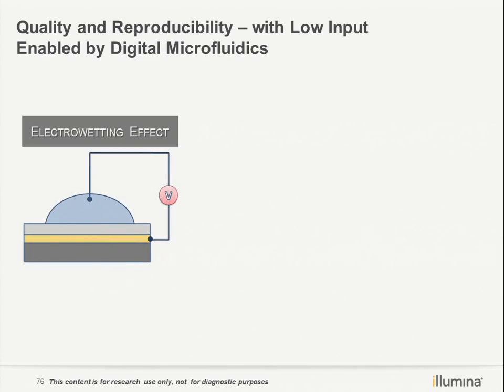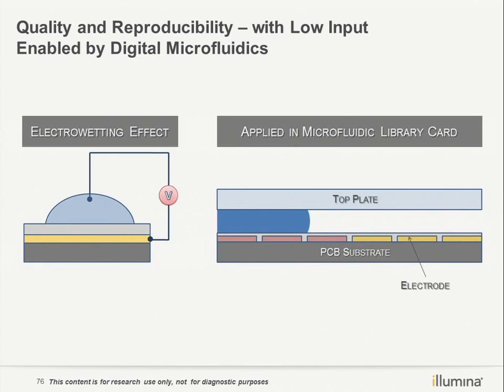This machine is based on a very attractive technology called electrowetting. When we change the voltage, we can change the surface tension of the surface feature from hydrophobic to hydrophilic. In this way, we charge each area individually, and we can make the droplets move, separate, or merge together.